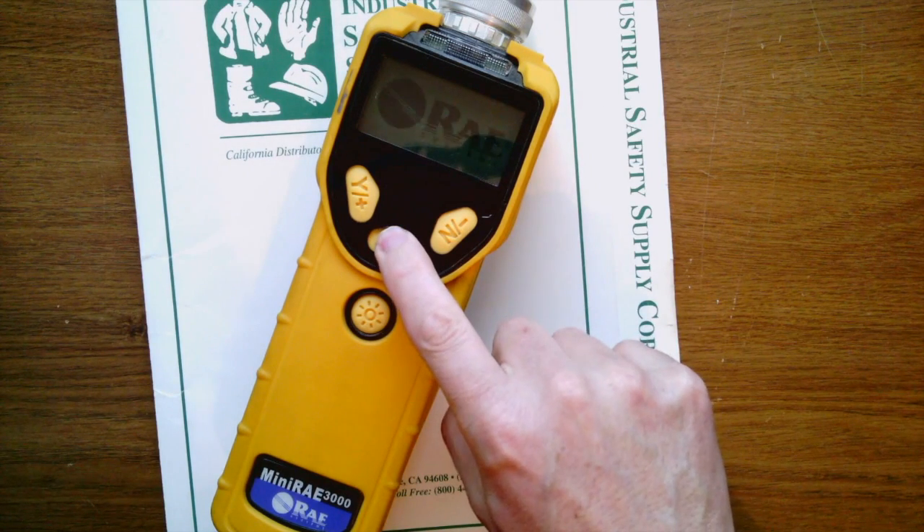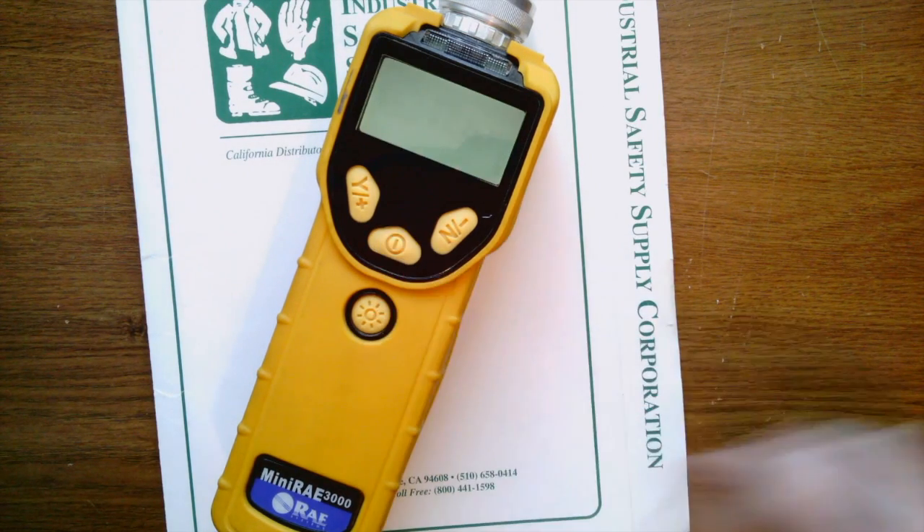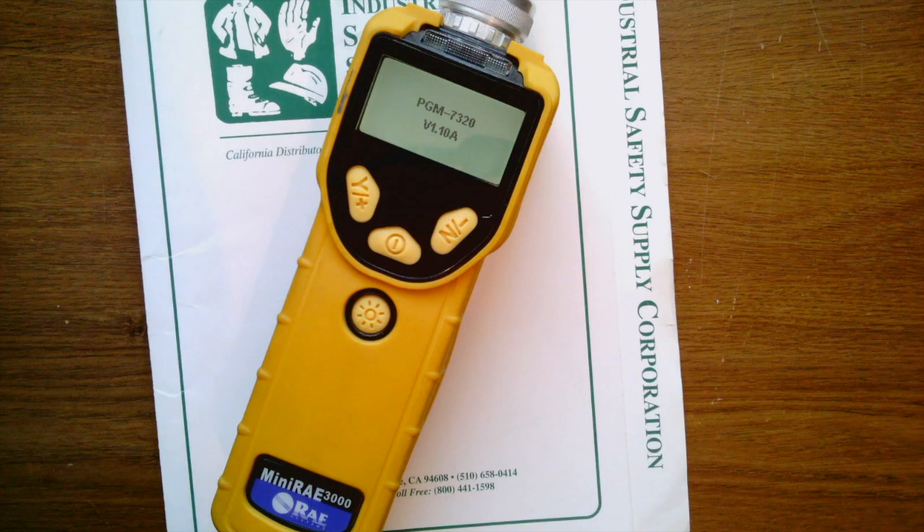Go ahead and turn it on. In just a second here it'll be up in real-time readings. You'll notice that the correction factor equals one isobutylene.